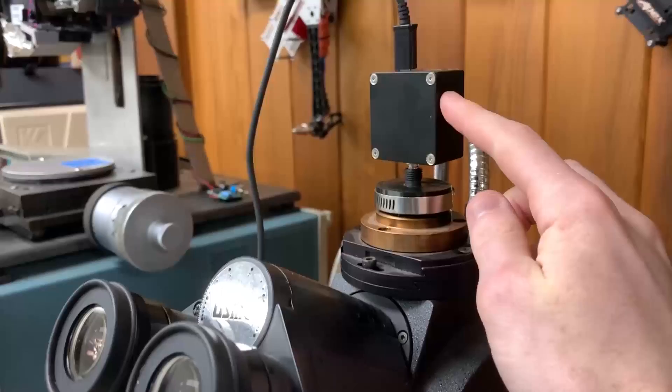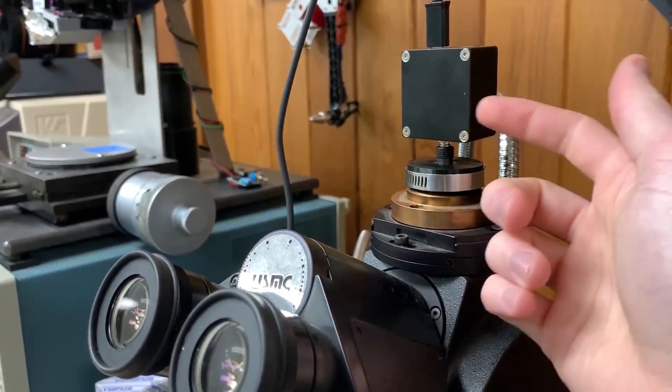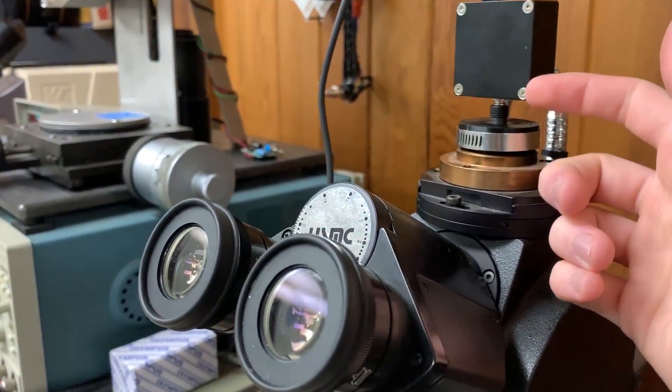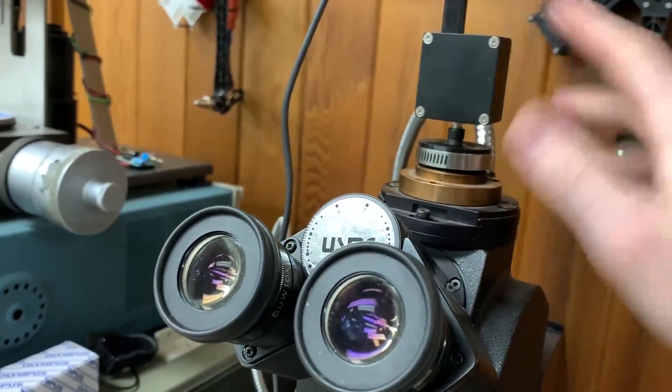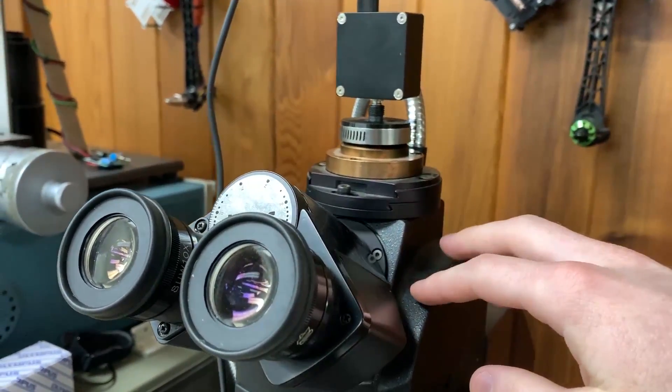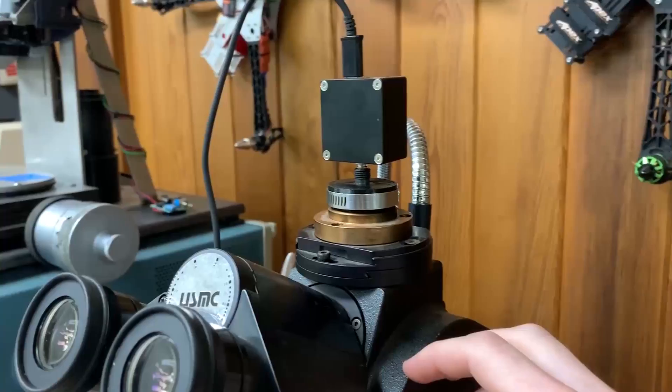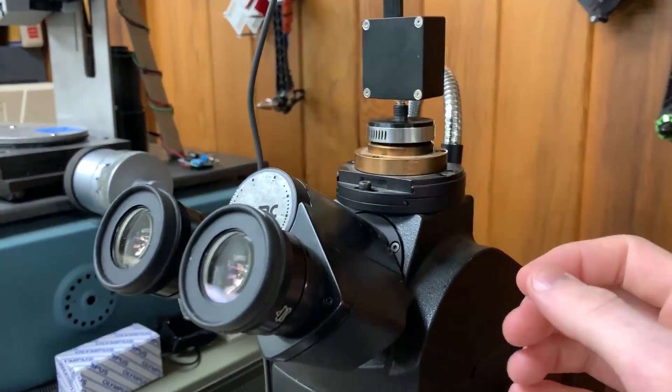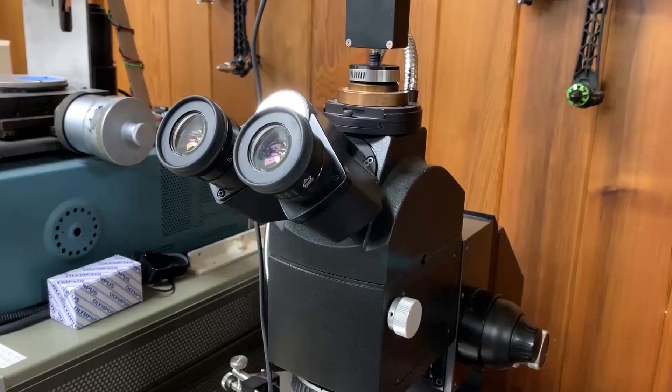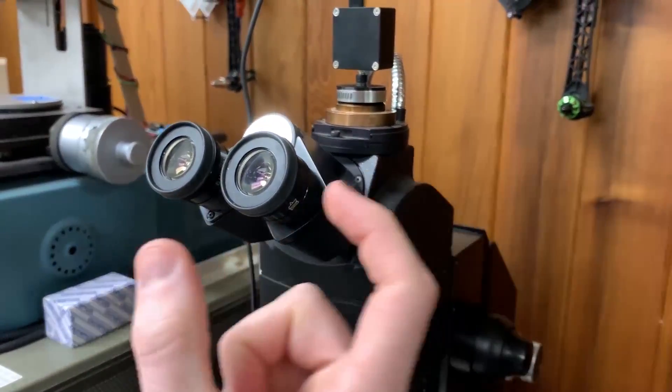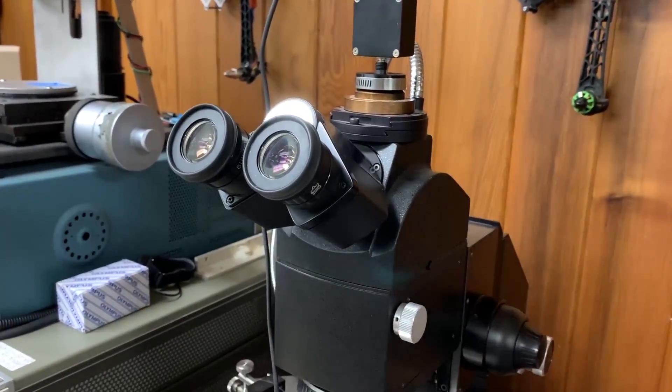For the spectrometer I've got this ocean optics STS UV visible spectrometer. They're on eBay for like $400 or so you can get them for a little less if you're patient I think. And there are a lot of other options you're mainly looking to analyze light in the range of say 400 to a thousand nanometers any band of that that's about 400 to 500 nanometers wide.